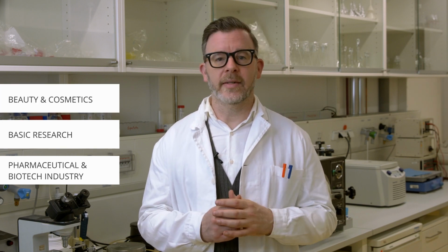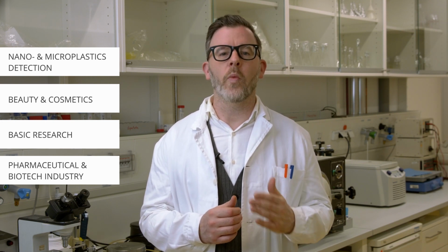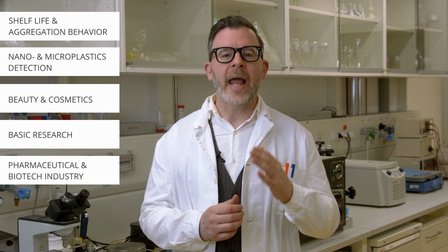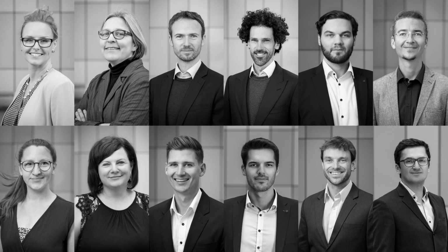Beauty and cosmetics, studying toothpaste and sunscreen production. Detection of very low concentrated particles for nano and microplastic detection, as well as ultra-pure water and water for injections. But also studies on shelf life and aggregation behavior of liquid medicines. As I found out, they're very keen to find their boundaries. So are you up for the Brave challenge? How about your ideas? How do you want to challenge them?